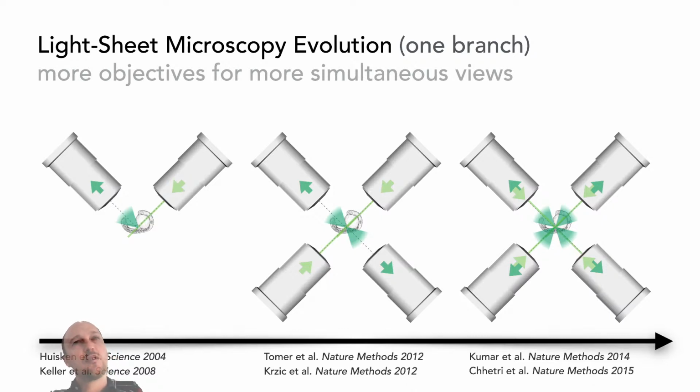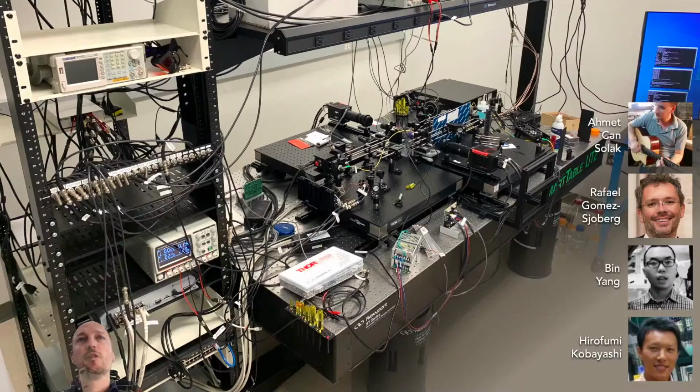But of course, it imposes a little bit of a hurdle for the experimentalists to be able to mount the samples in a way that accommodates all these objectives surrounding it, right? And this is maybe not a natural thing for biologists to do.